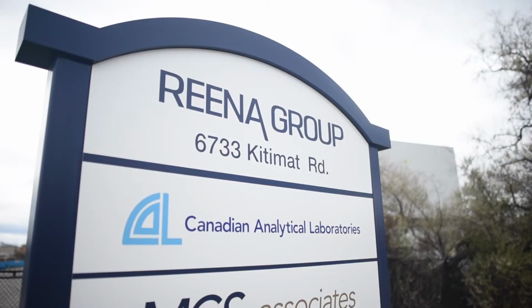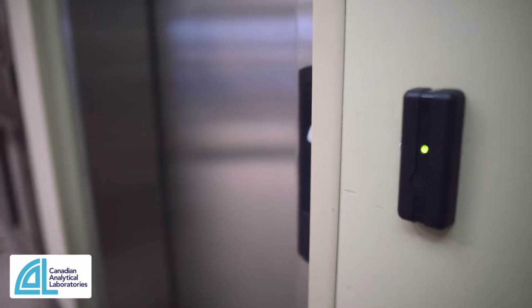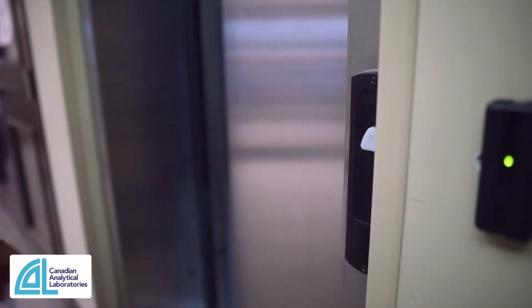Welcome to Canadian Analytical Laboratories. Today we're going to take a tour of the facilities and show you some of the toys we have upstairs. The entire building is access controlled here, including the elevator that will take us to the second floor.